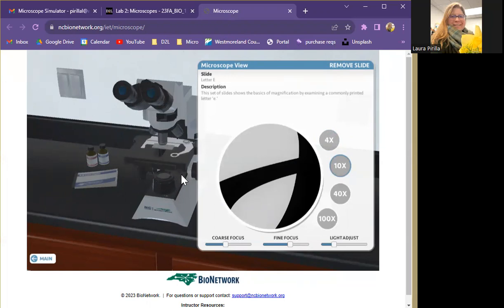As you move the lens away from being in use, it sort of clicks into place a little bit. And when it clicks out of place, it's like being at the eye doctor when they say one or two, and you know how there's this moment where you can't see anything. It's because you're not actually looking through a second lens, so the light goes in through the eyepiece and kind of stops.